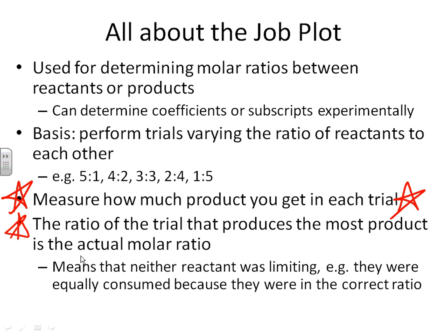And when I say the molar ratio here, this is typically done by controlling the concentration of the solution. That's what we're doing in this particular lab. We know that everything is 0.1 molar, we just don't know what it is. So that's our way in for controlling the mole aspect of it. Okay, so this is the idea. This is the fundamentals behind a job plot.